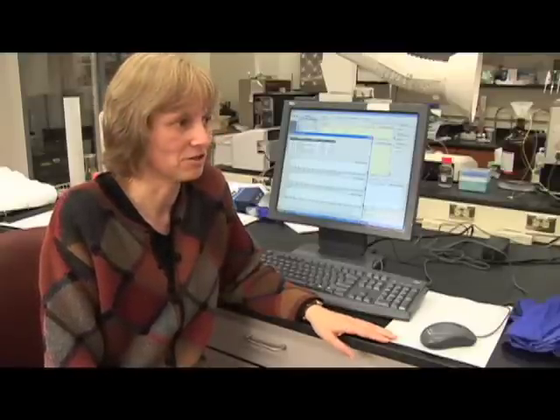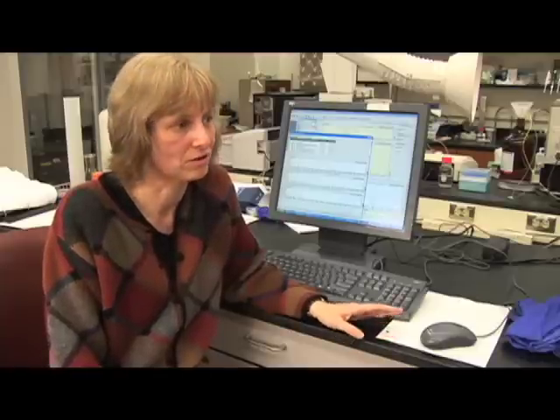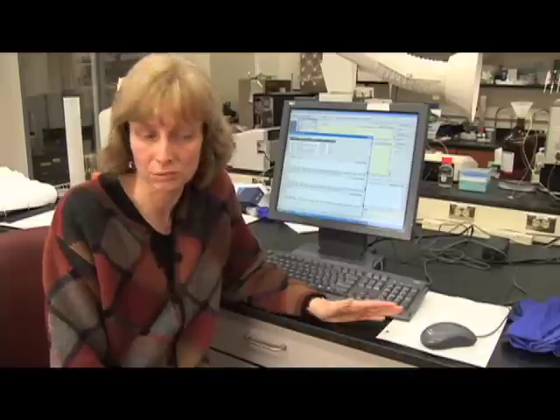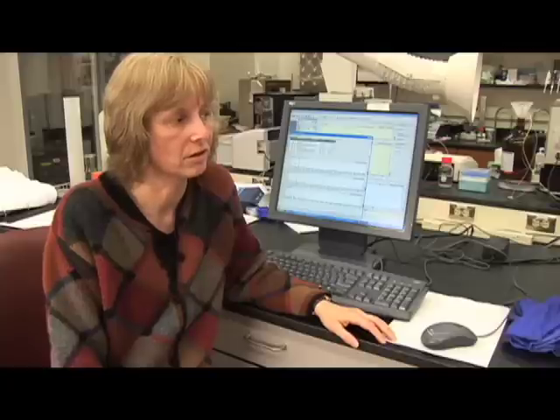So we're now pretty much at the end of that little demonstration here, and I hope you got an overview and an idea how gas chromatography mass spectrometry works. And please don't hesitate, if you have further questions, to contact me, and hopefully I can provide some more information. There will be additional slides in terms of how the detector works, how the injector looks like, etc.